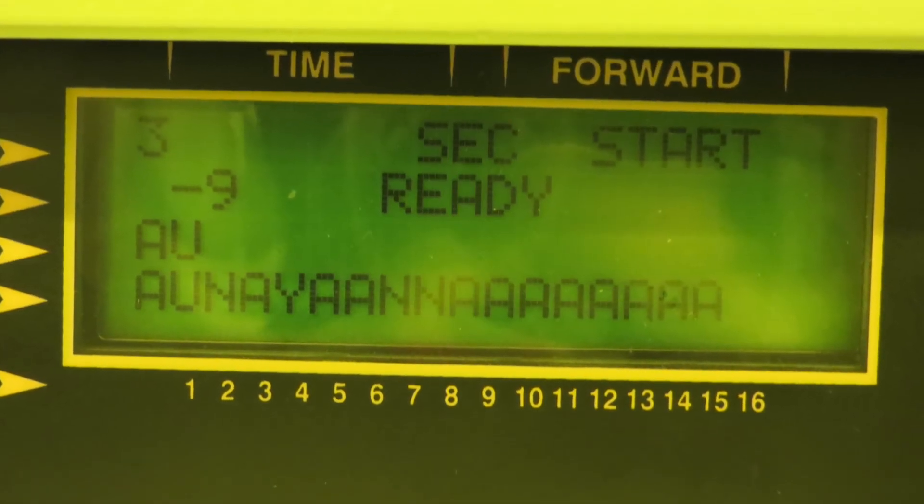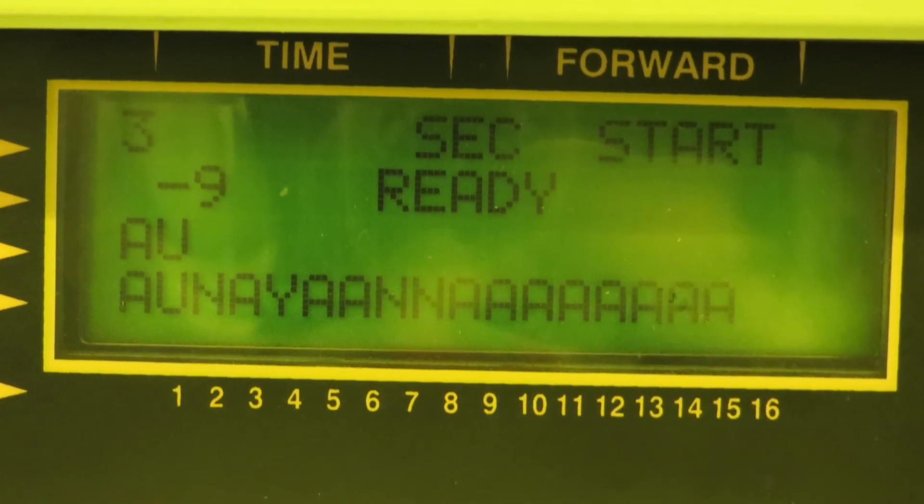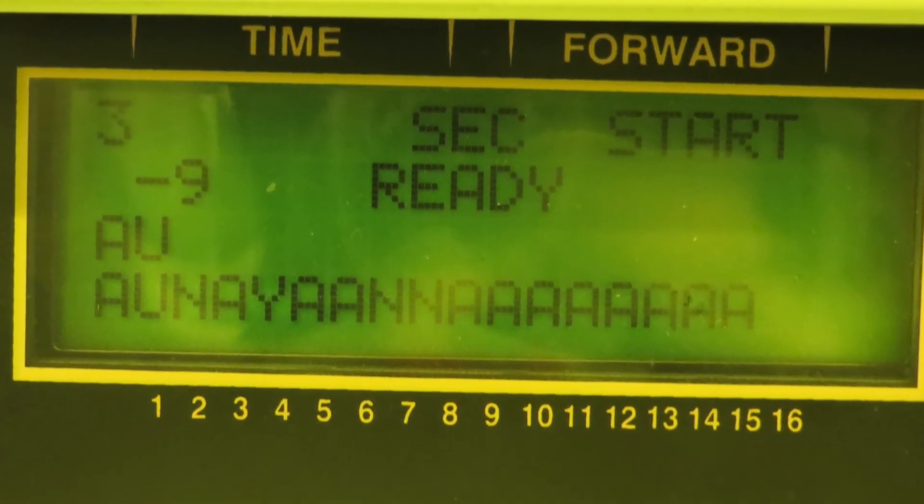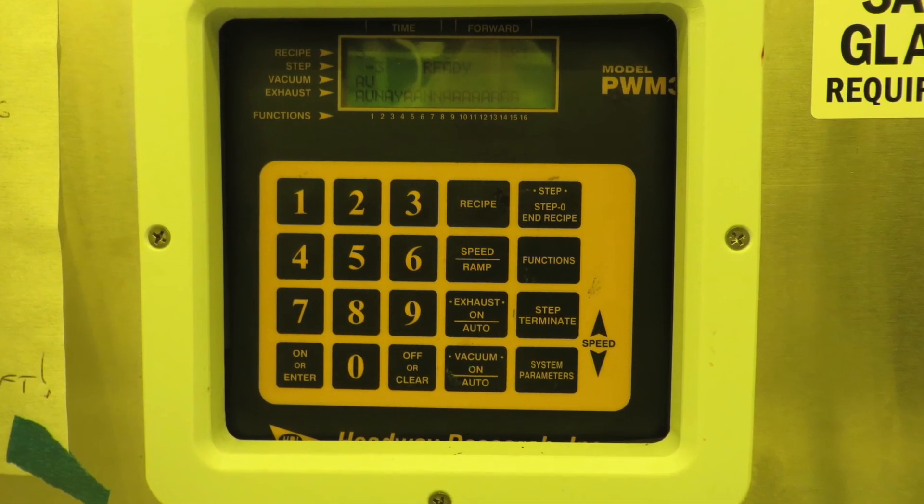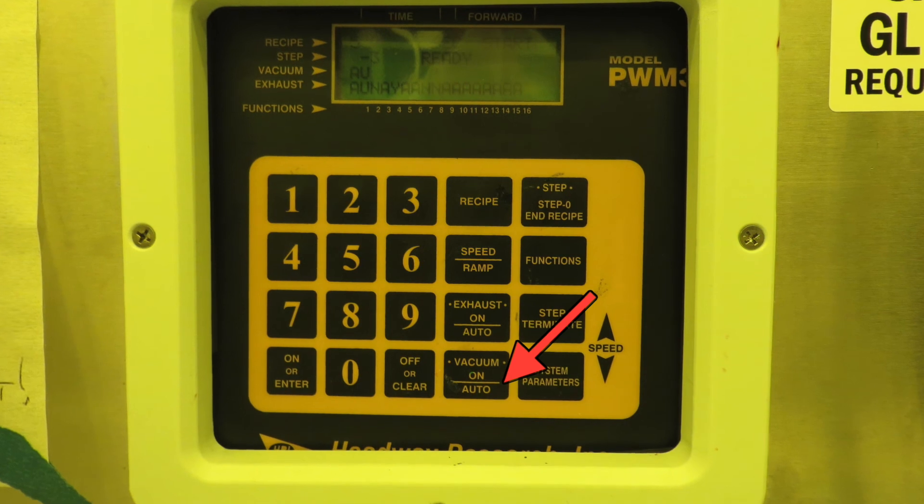When vacuum is in auto mode, it pulls vacuum during the entire cycle. But it is also possible to manually turn vacuum on and off. If you want to turn vacuum manually on, push this vacuum on/auto button. It will toggle back and forth between manually on and auto.